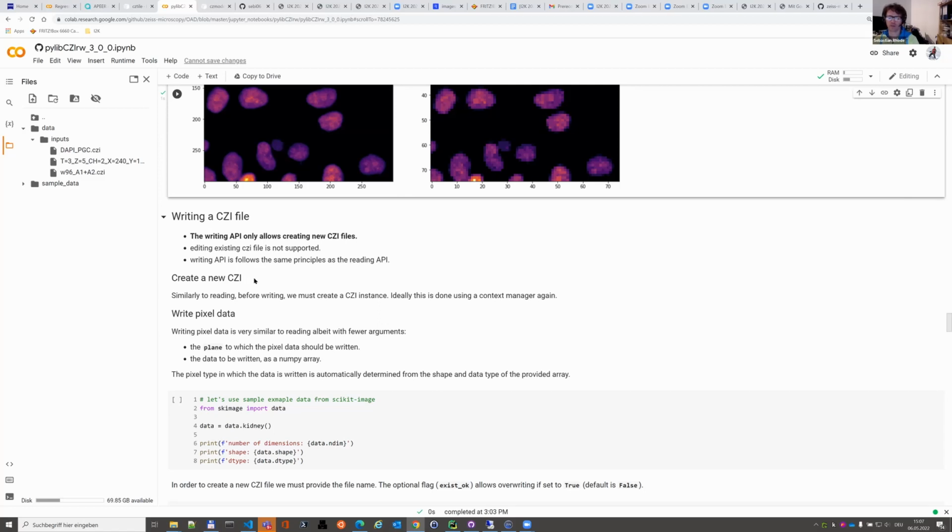For instance, we have a software called Core, which is a workflow software where you can create your own Docker containers for your processing functions. In the beginning, we said, a Docker container as an input can have everything, as an output can have everything. This sounds intriguing, but in specific workflows, really using the same specified file format all the time saves so much time versus supporting all kinds of file formats.